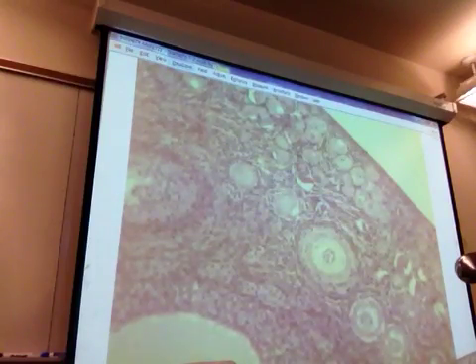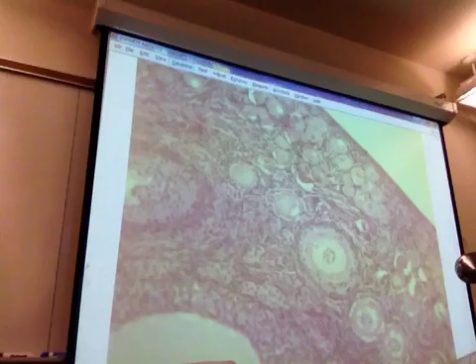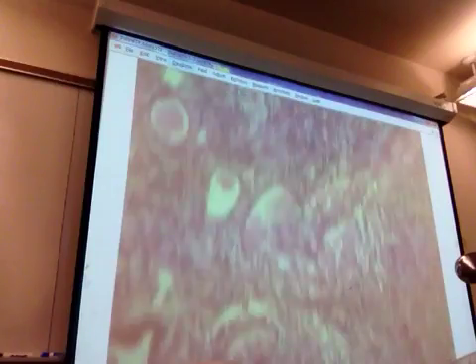So you said, like, what cell is it? If you need a granulosa cell, but then the structures right at it. If I say structure, I would be pointing specifically to the cells, like if I was showing you a tertiary follicle and I wanted corona radiata.